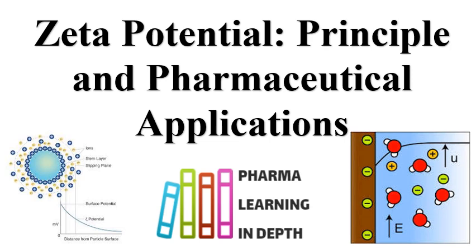As we know that the particles have charge, and mainly zeta potential is related to the particles which are in the liquid.